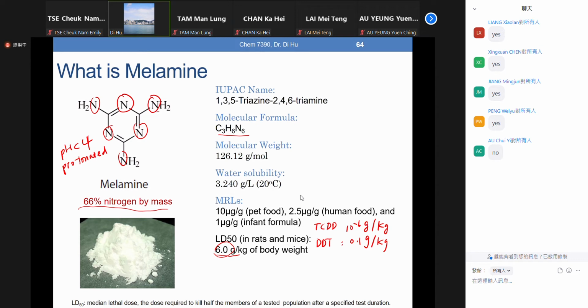Then you add sodium hydroxide, a strong base, to release ammonia gas, and use boric acid to capture that gas and make ammonium ion again. Then you back titrate the boric acid to see how much was used to capture the ammonia, and from that you know the moles or mass of the ammonium.